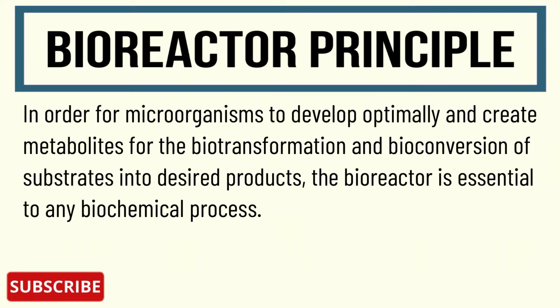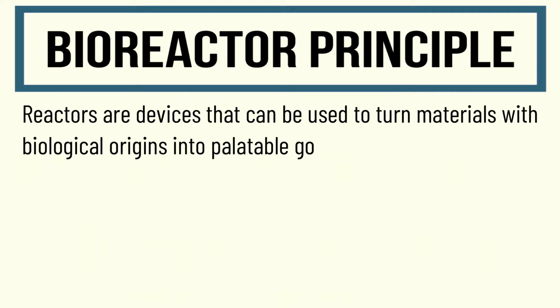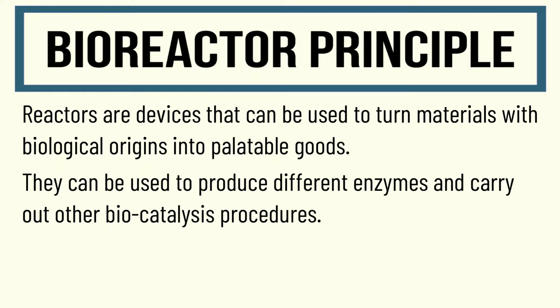Let's understand the bioreactor principle. In order for microorganisms to develop optimally and create metabolites for the biotransformation and bioconversion of substrates into desired products, the bioreactor is essential to any biochemical process. Reactors can be designed or created based on the needs of the organisms employed for growth. Reactors are devices that can be used to turn materials with biological origins into palatable goods. They can be used to produce different enzymes and carry out biocatalysis procedures.